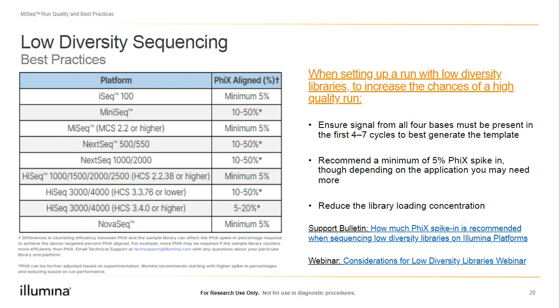We did include a support bulletin here for how much PhiX spike-in we recommend with low diversity libraries. And I also recommend checking out a webinar, which I recently presented on, called Considerations for Low Diversity Libraries.